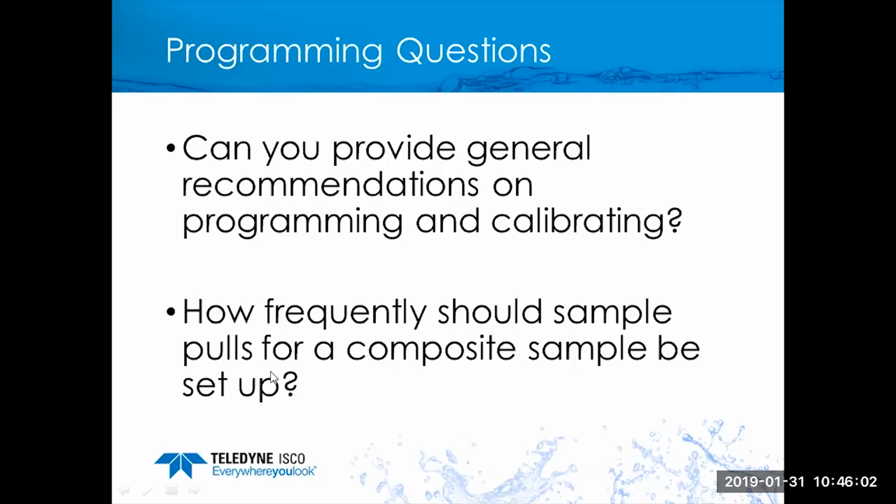If you have a unit that has a liquid detector, the things I would start to look for are: is there any potential source that could interfere with the ability of that liquid detector to sense the presence of liquid? Do we see air slugs getting pulled up in the line? Is our intake fouled or blocked or restricted to a point where the efficiency of the pump has dropped way off?